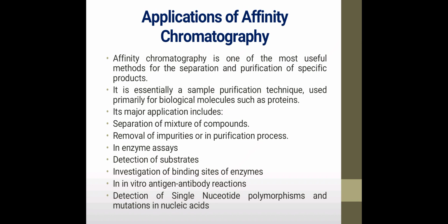This is found to be a complementary one, like antigen antibody reaction or enzyme inhibitor complex, etc. So it is found to be very specific. Based upon the ligand, that is, based upon the product or the analyte to be separated, we have to select a suitable ligand and the separation process can be carried out successfully.